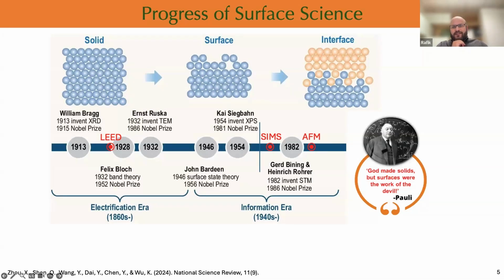So in modern devices, the bulk provides, as I said, the structural stability, but the surfaces and interfaces drive the functionality, meaning they drive the application. So the progress of surface science is a fascinating journey that spans more than a century.